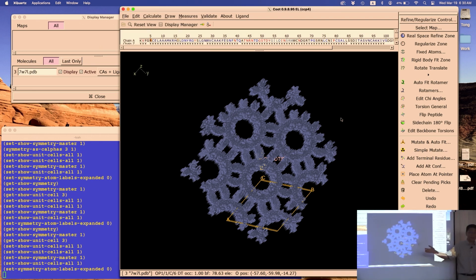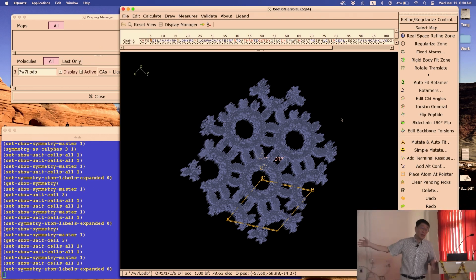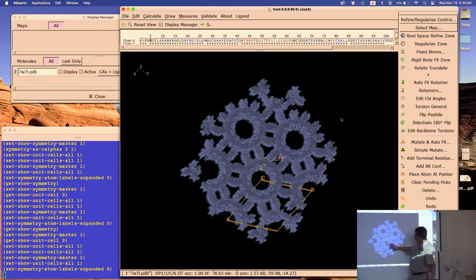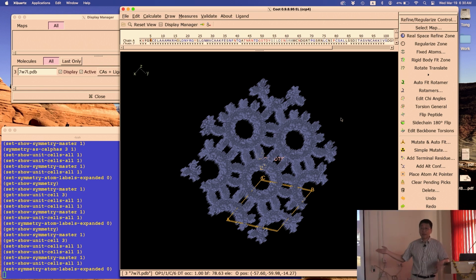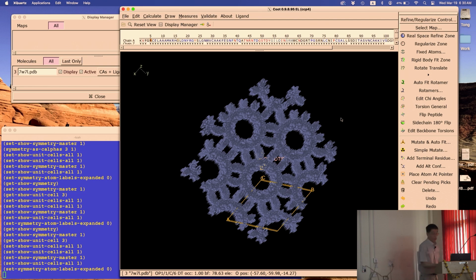That's the whole point. You probably see something similar, not exactly the same, but that's okay. So this is to show you how molecules are arranged into a crystal lattice, a beautiful pattern like that. Okay. So if you have something closer, similar to this, is fine. If not, you can play around when you have time. Okay, so that's it for Coot, I think. All right? So we'll stop Coot.